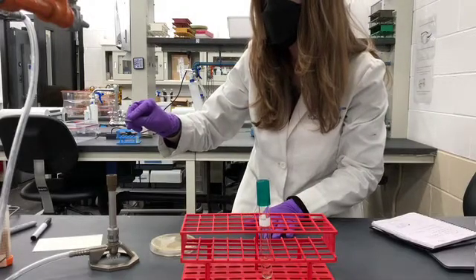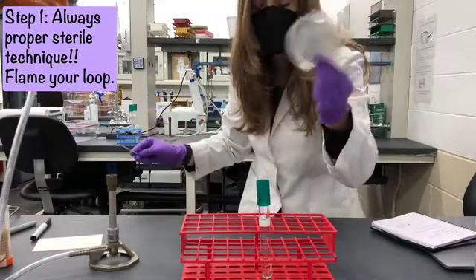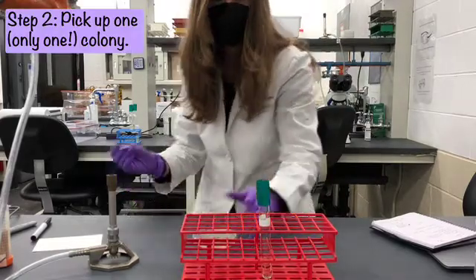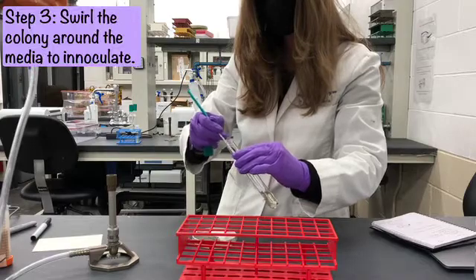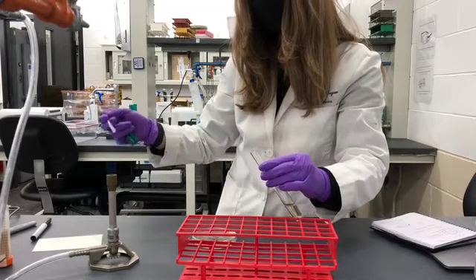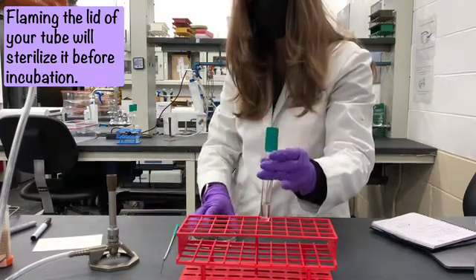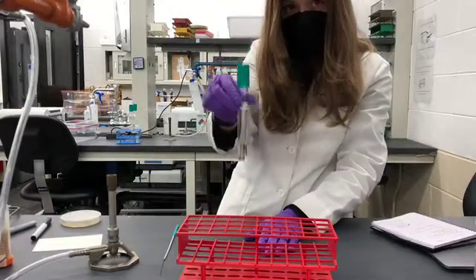To inoculate this tube, we are going to flame our loop. We're going to collect our streak plate from the previous week. We're going to cool our loop by putting it in an area where there is no bacteria, and then we will collect one colony, take off the loop, and inoculate into the broth and sterilize. Another thing we might want to do with any of the glass tubes is do a quick flame back and forth, which prevents potential microbial contamination.